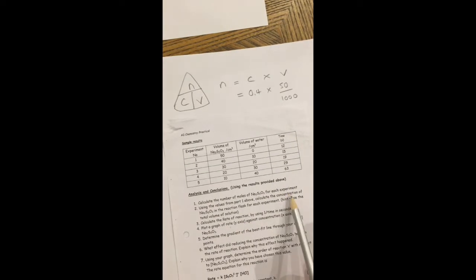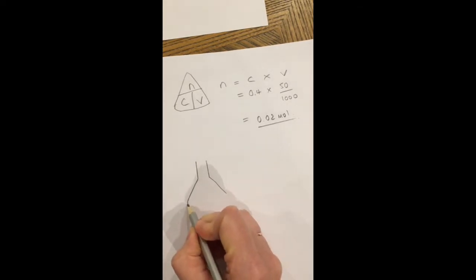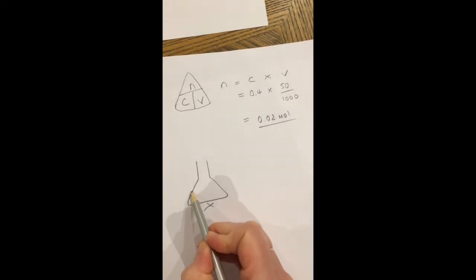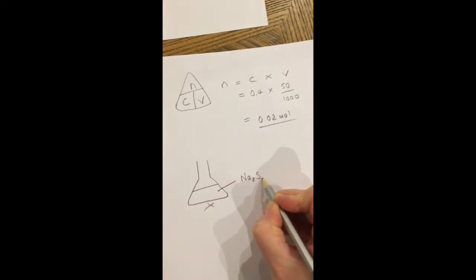Okay, your next job then was to calculate the concentration of the thiosulfate in the reaction flask. So if you cast your mind back to the practical, you did it with a conical flask, you had the cross underneath, and into that flask went the thiosulfate.